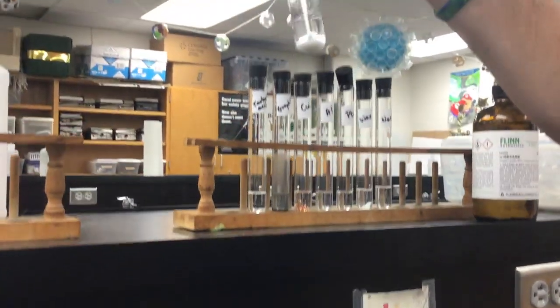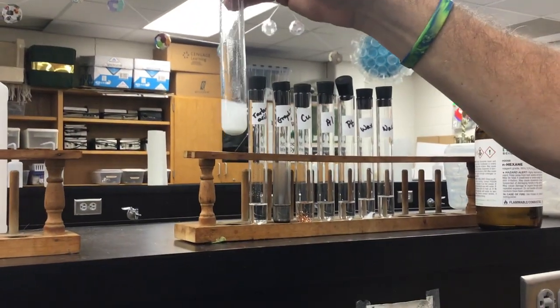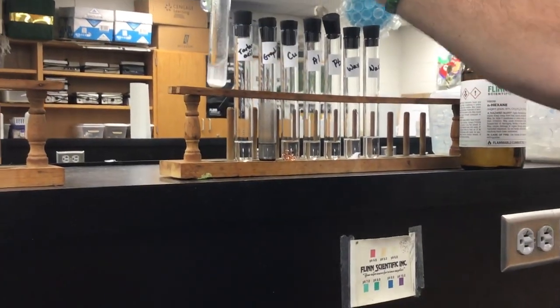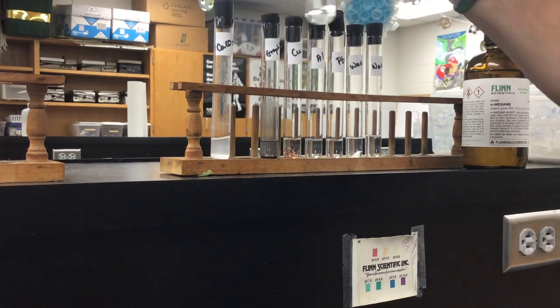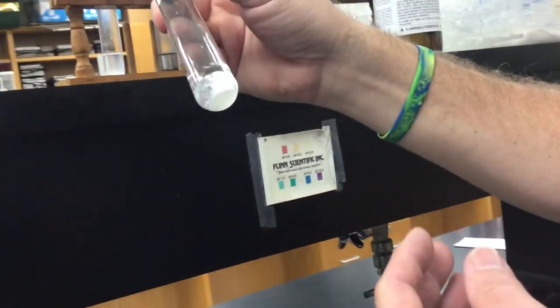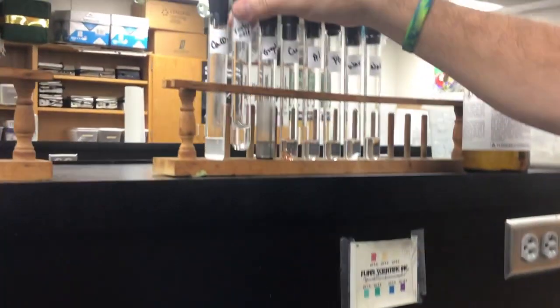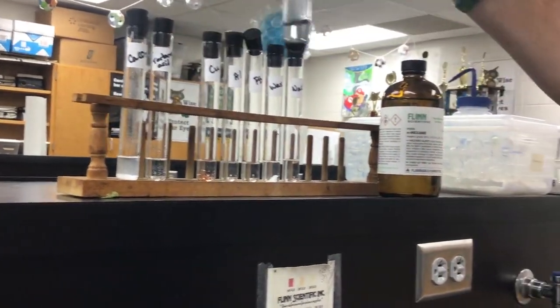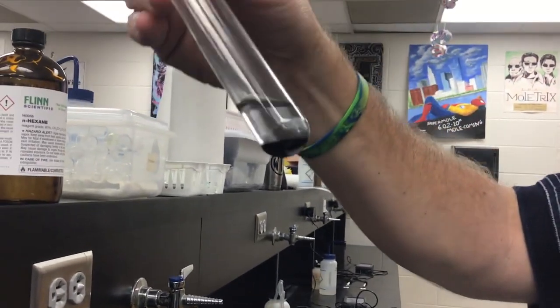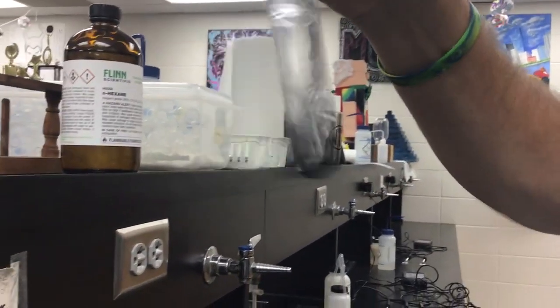Here's calcium carbonate. It's just all settled there on the bottom. I can shake it all up, but you can kind of see it settling out on the bottom pretty quickly there. For the tartaric acid, still see that kind of down there on the bottom. And then the graphite. Ooh, look at the graphite in this. This is a little different, isn't it? So write down what you think's going on with that graphite.